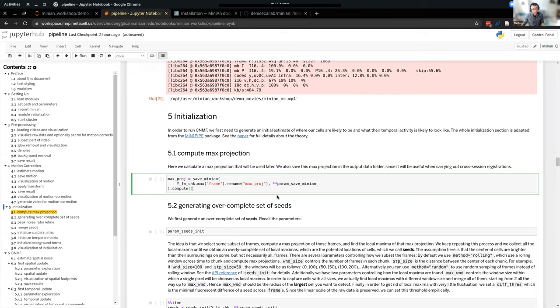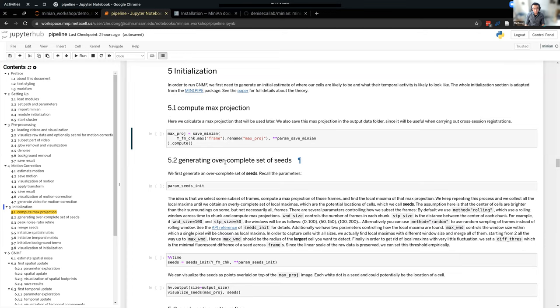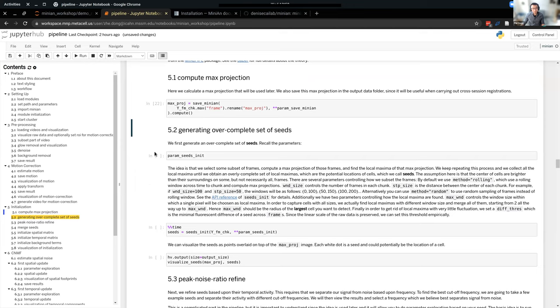We have the data basically cleaned up and ready for extraction. Before I actually run the CNMF, we need this initialization section, which basically gives you an initial guess of the spatial location of cells and the temporal activity of cells. That's what the initialization section is doing. Let's go ahead to section 5.1.